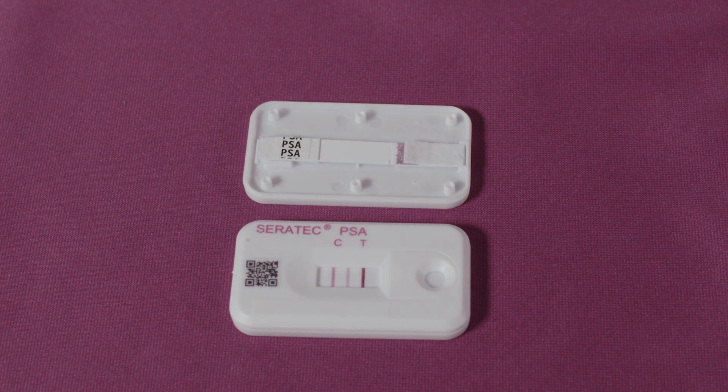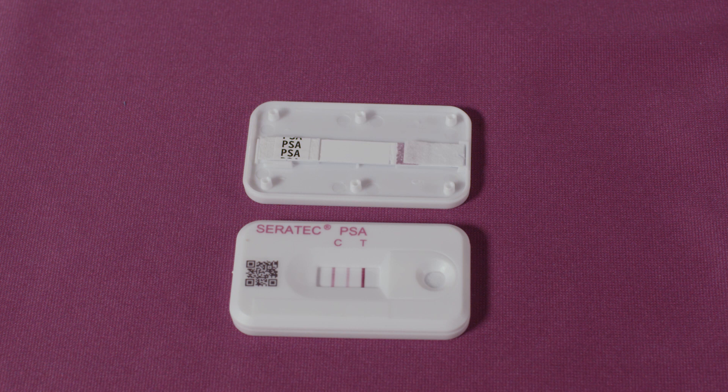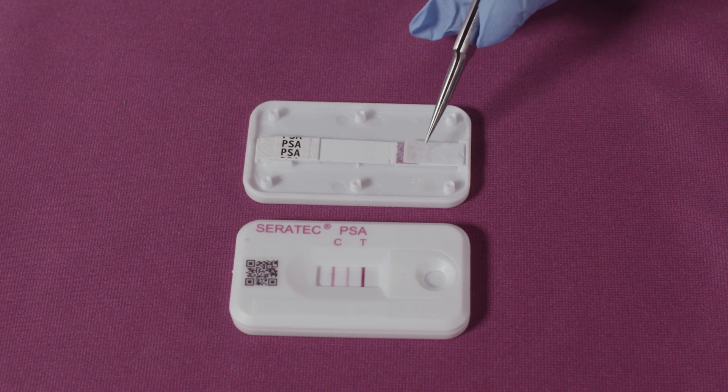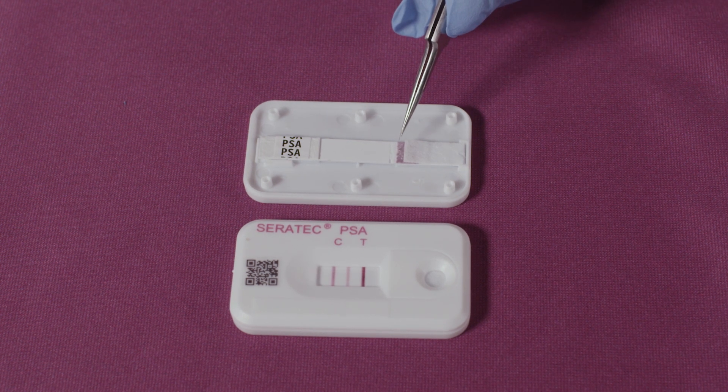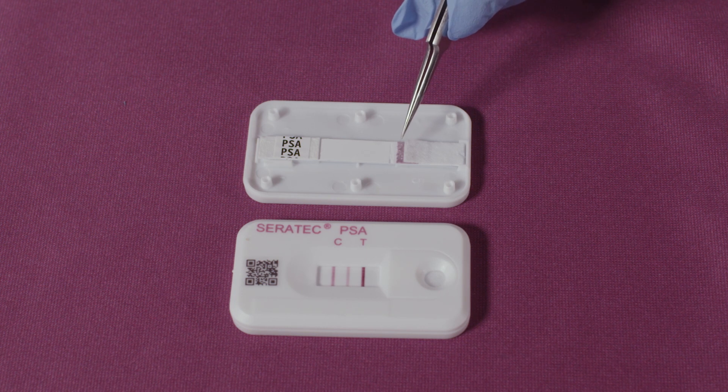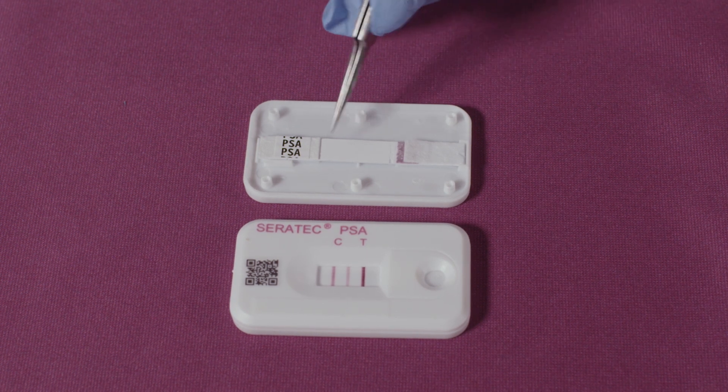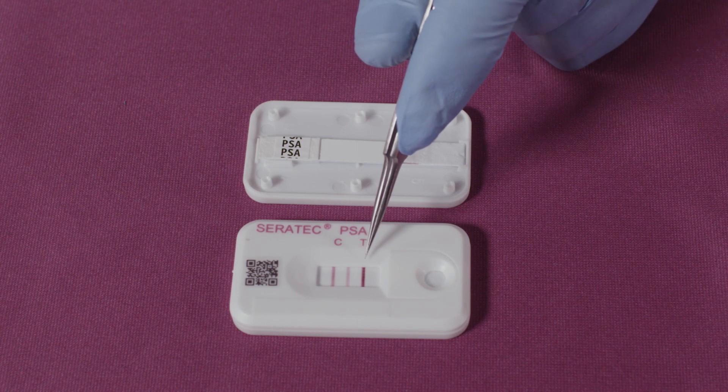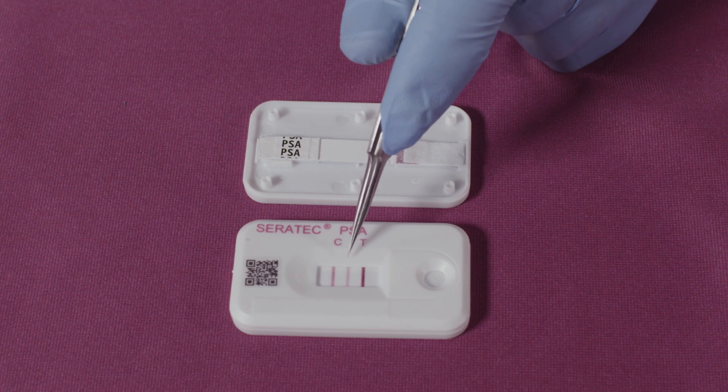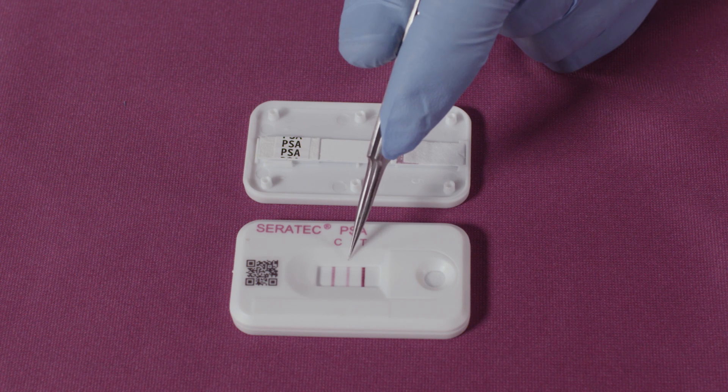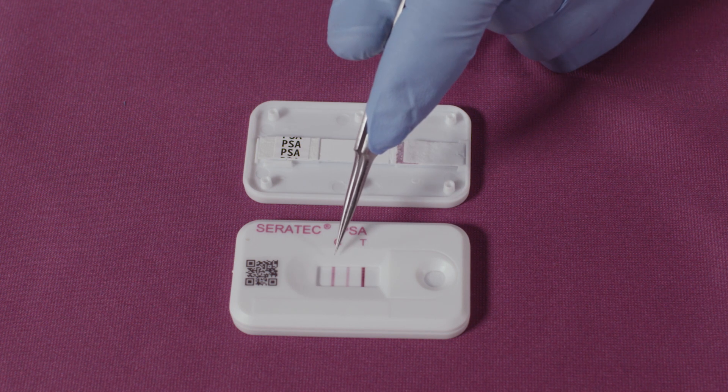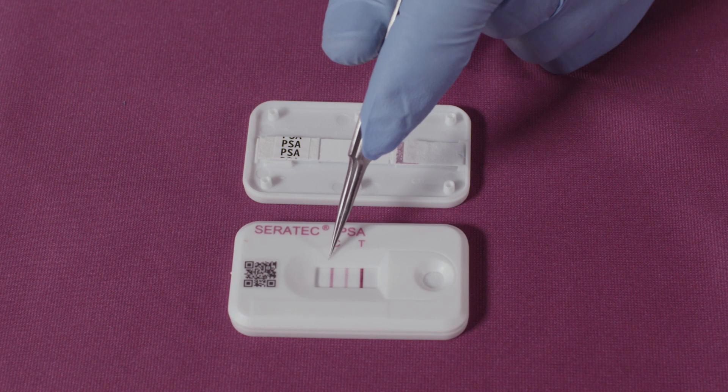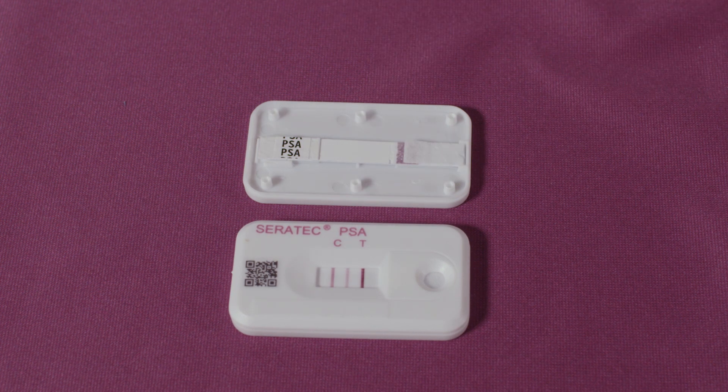The Ceratec PSA semi-quant test cassette consists of an absorbent pad, a gold labeled mobile human specific monoclonal antibody to human PSA, a nitrocellulose membrane, a second different fixed human specific monoclonal antibody to human PSA, an internal standard sample adjusted to a level of four nanograms per mil of PSA, and a control line containing anti-mouse antibodies.